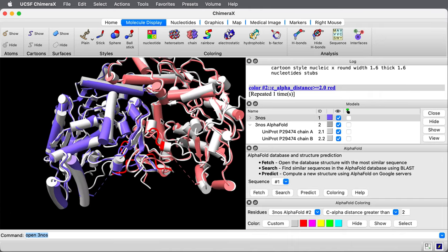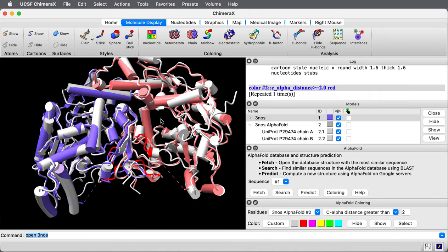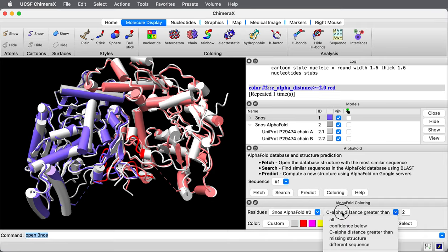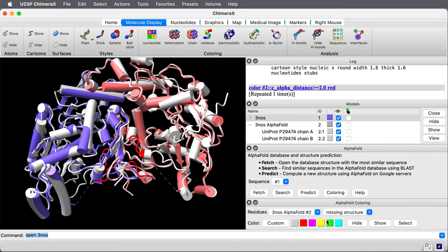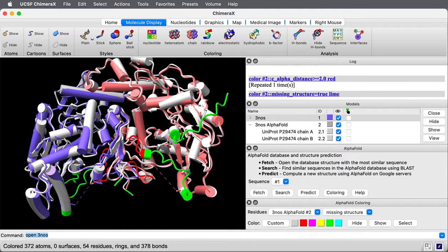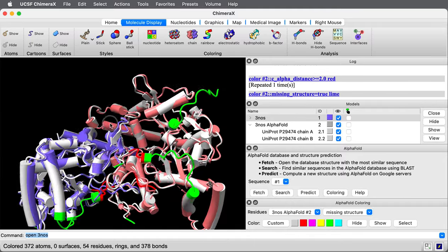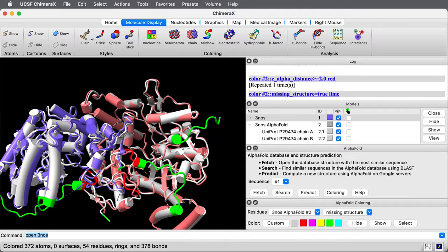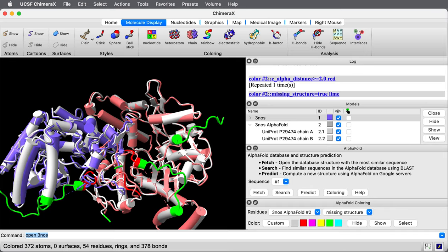What else can we see by comparing these two structures? Let me choose from this menu in the coloring tool missing structure, and I'll press the green square here. This has colored the regions in the alpha fold structure where we don't have any coordinates in the experimental structure.